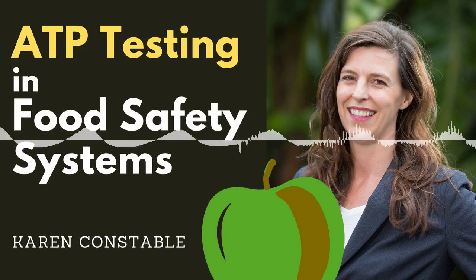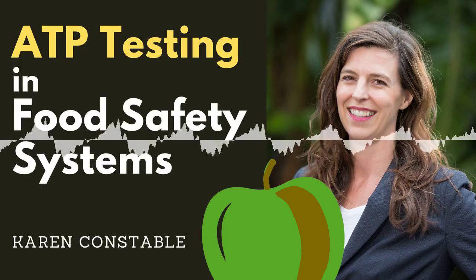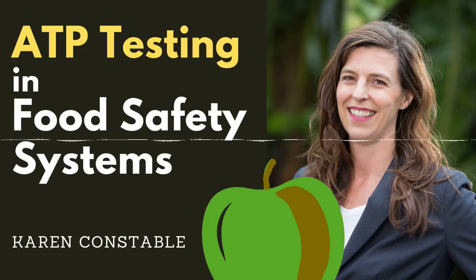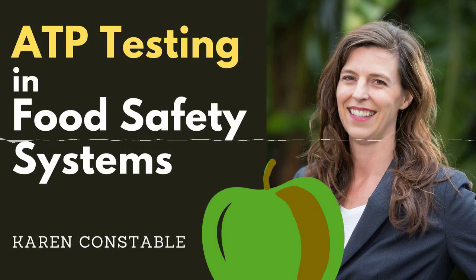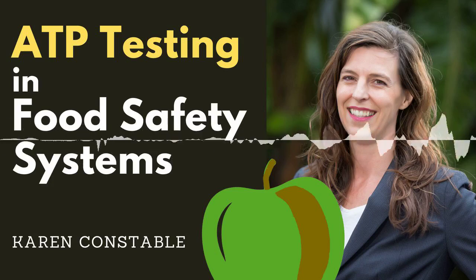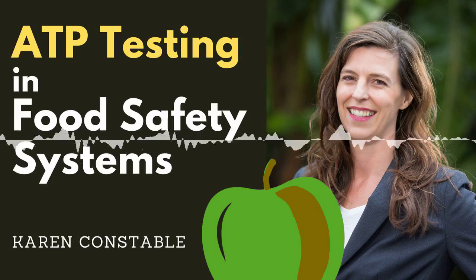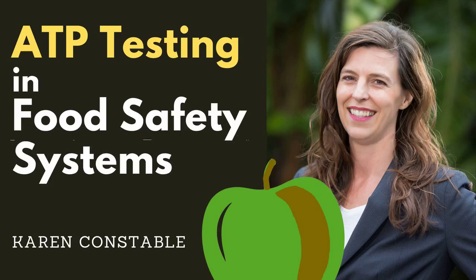How does the food industry use ATP testing? ATP testing is usually conducted in-house by the food company's personnel. It's used for verifying that surfaces have been properly cleaned before they are sanitised and for environmental monitoring programs. ATP swabbing can be used to measure the cleanliness of direct food contact surfaces such as slices, utensils or conveyor belts.